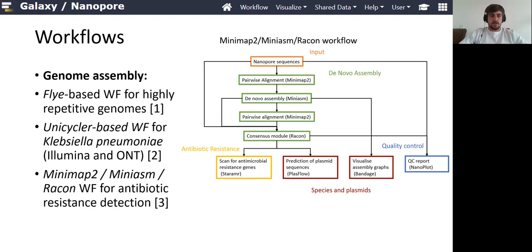We have three different workflows for genome assembly. The first one is a Flye-based workflow for highly repetitive genomes. We have a Unicycler-based workflow where you can input, besides long-read sequences, also short-read sequences. In this way you can use the advantages of both sequencing techniques.